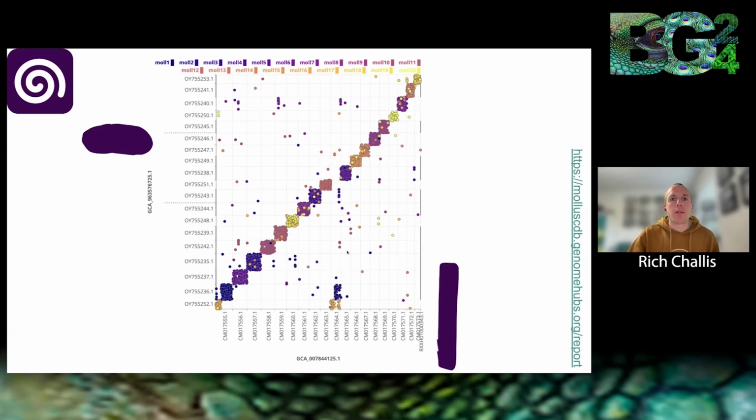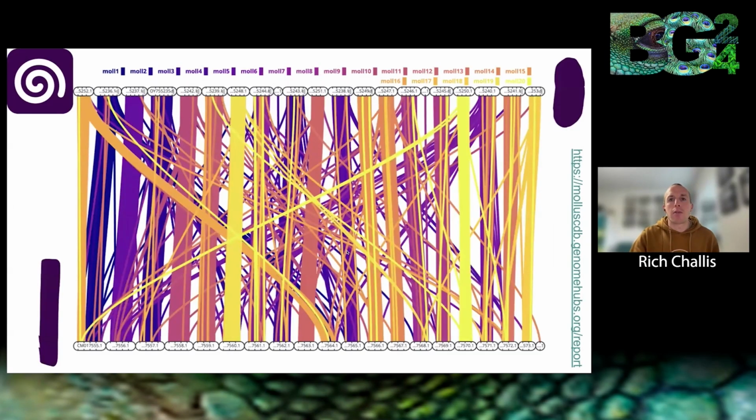So highlighting ALG1 again, you can see that it's present in a single chromosome in the closest taxon, which is shown on the y-axis here. And the same is true for ALG16. So rearrangement of these in Cynonobacula appear to have been recent. To get an alternative view of the same data, we can switch to a ribbon plot, which helps to emphasize loci that have changed location between these 2 species.